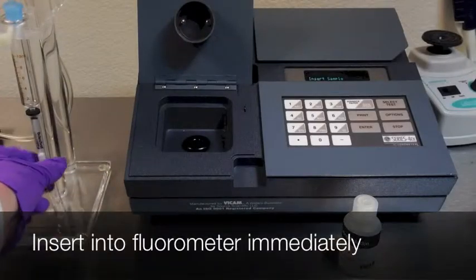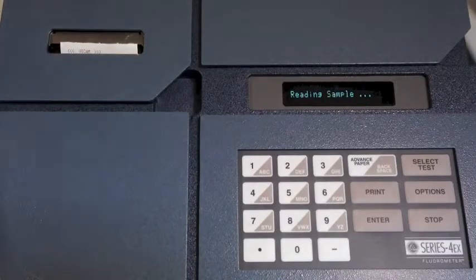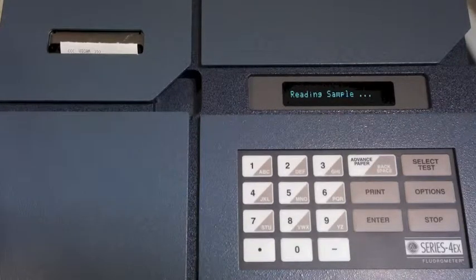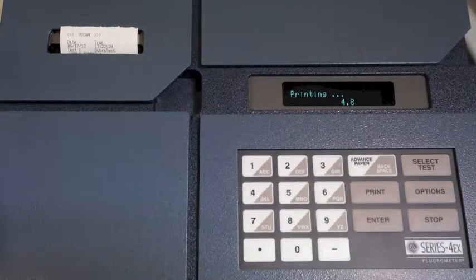Very carefully apply air pressure and pass one drop per second through the column into the cuvette. Wipe the cuvette and place into the fluorometer immediately. In 60 seconds, you have your results. The printer will produce a time-date stamped copy of the results for your records.